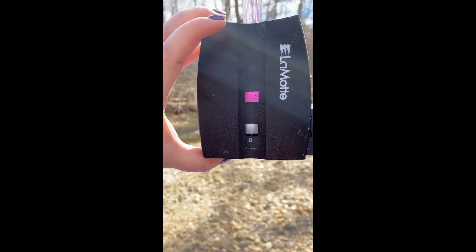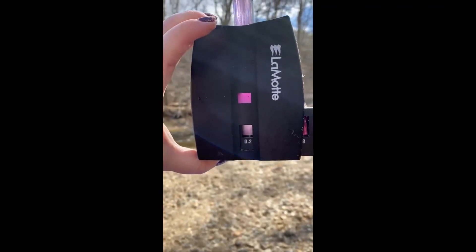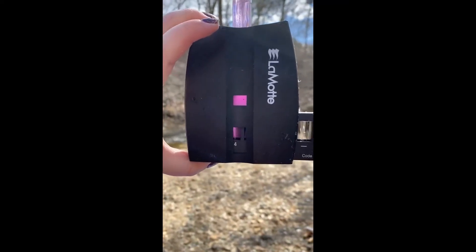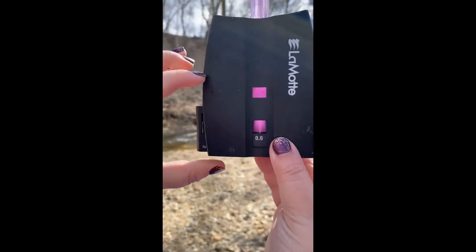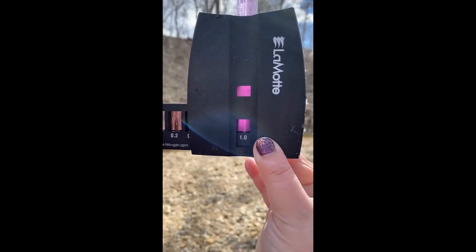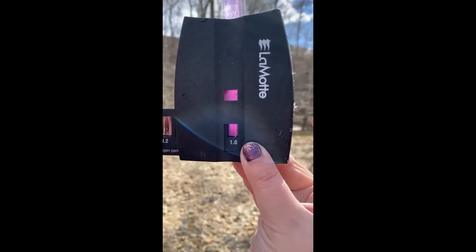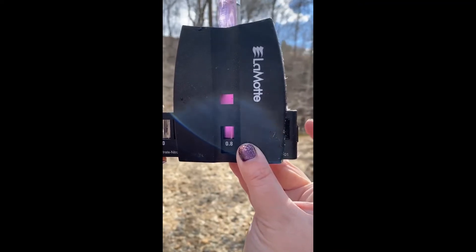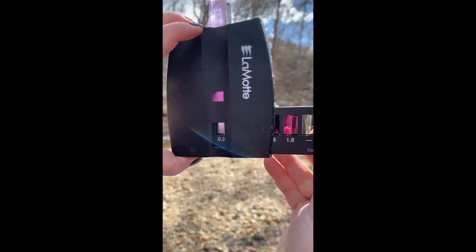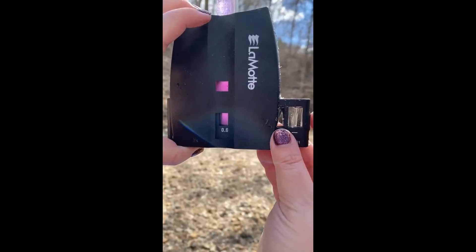Now we're going to run our comparator for our nitrate. Our pink up top is our sample and we'll run our comparator through until they match. Somewhere between those two — that's close.